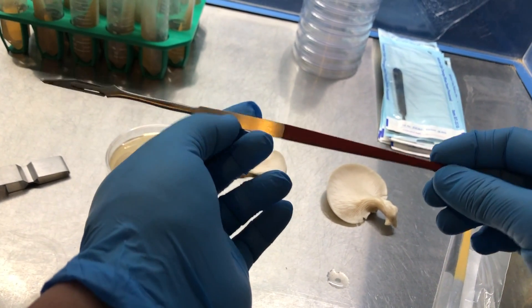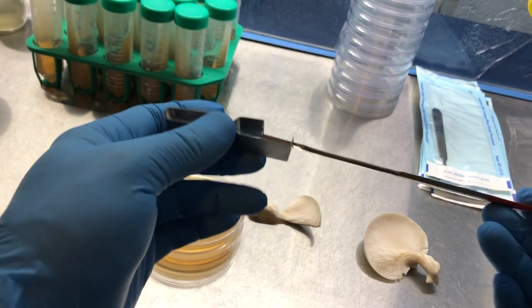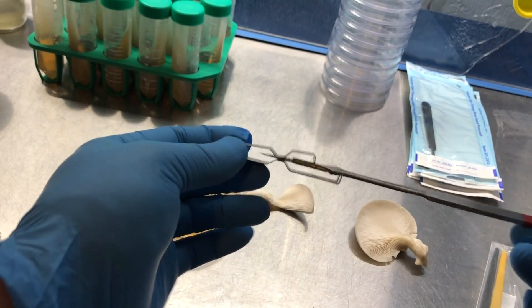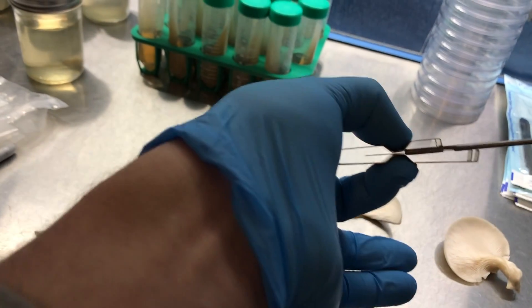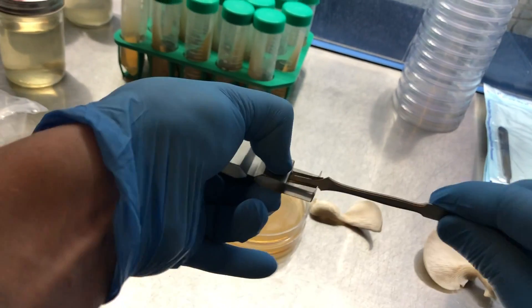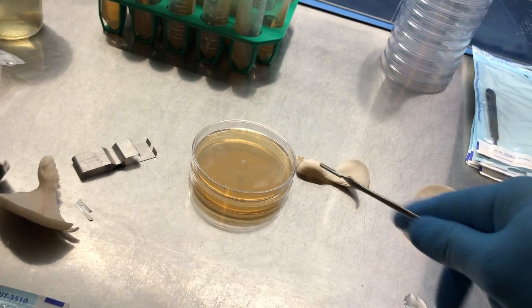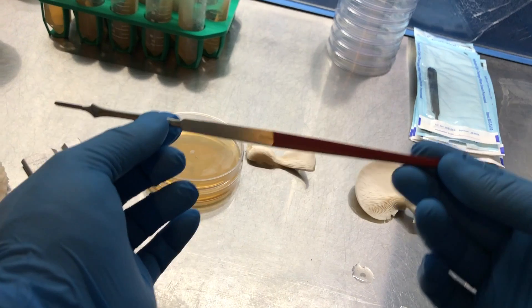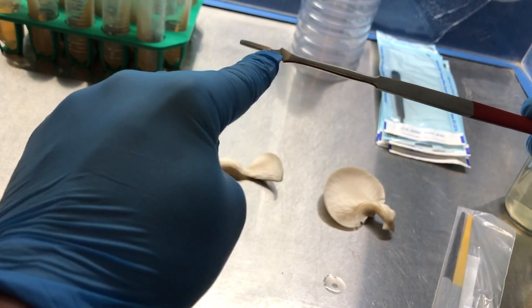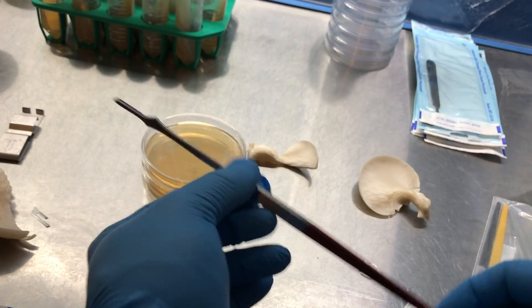One criticism I have is that I'm not sure the blade remover would fit on the end — it seems the bevel is designed to give the blade a nice area to rest on, but it gets in the way of where I would remove the blade with my blade remover. That seems to be my only critique. I can just do it the old-fashioned way: press it up with your thumb and the spare packaging. You can see that bevel blocks the blade remover, but overall I really like this blade handle and I look forward to using these in the future.